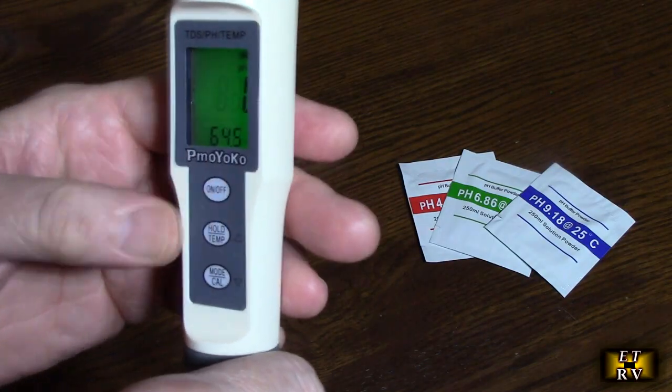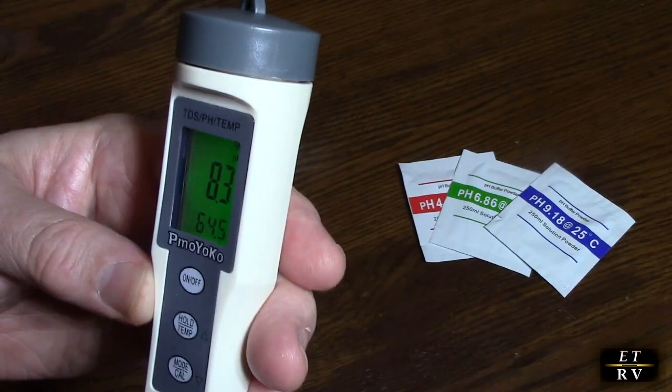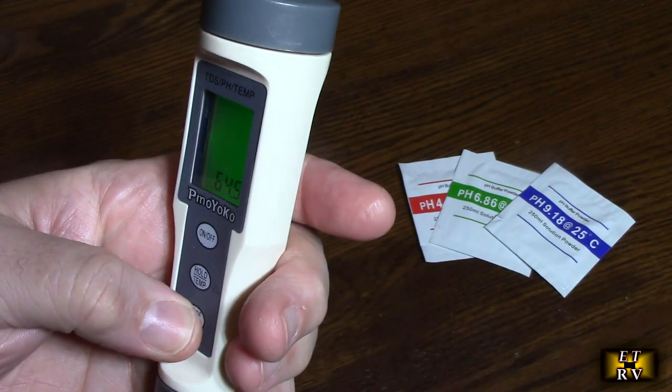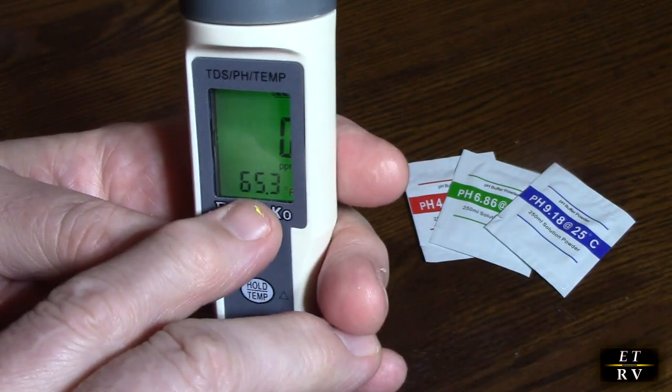So you have an on-off button right there, and you see the display comes on right there. Really nice. Now that's pH, and it's showing me the last value that I had. And then you go to mode right there, and you have parts per million right there, and right below is the temperature.